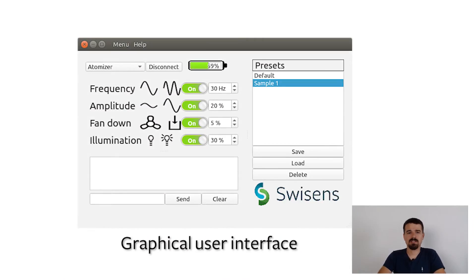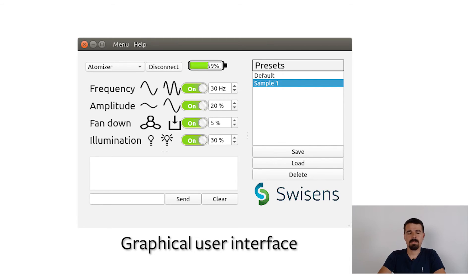Additionally, these settings can be changed on a remotely connected computer, either with command line inputs or the graphical interface. The GUI even adds the possibility of saving proven presets for sample types and applications.